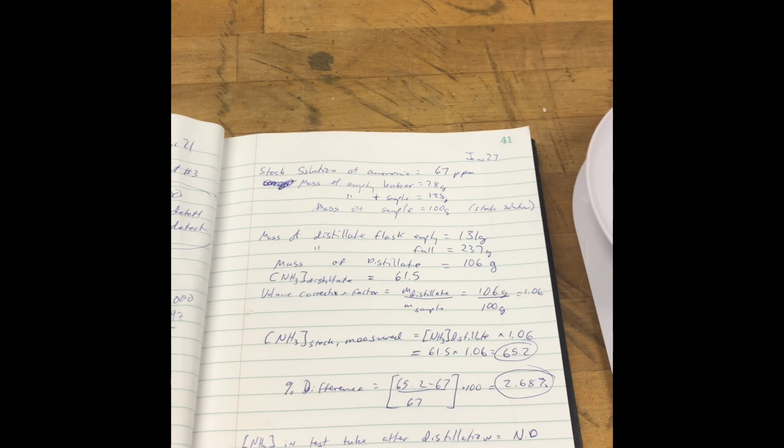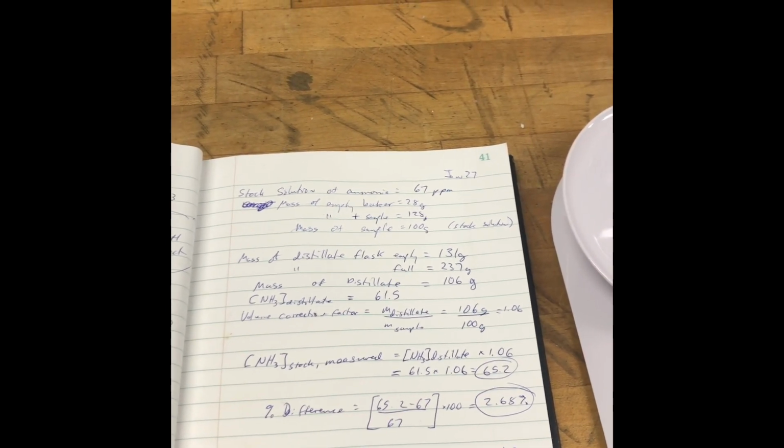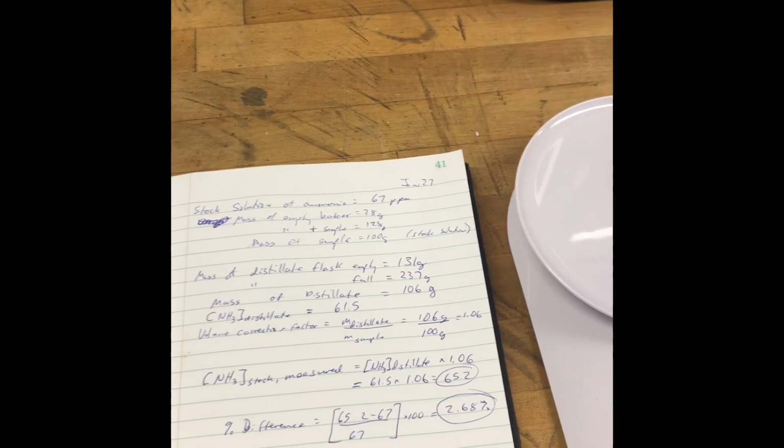And again, just to demonstrate that the ammonia was all carried over, I measured the concentration of ammonia in the test tube after the distillation was complete, and I got a non-detect.